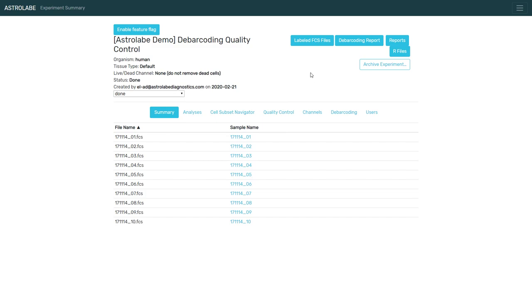And again, when you debarcode your data, make sure to monitor them. Make sure to have a look at the barcoding separation distance, at the yield, and the different biaxial plots for the barcoding channels, just to make sure that you're getting clean samples out of these.